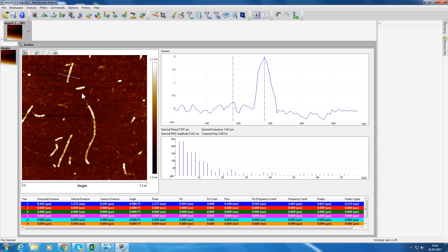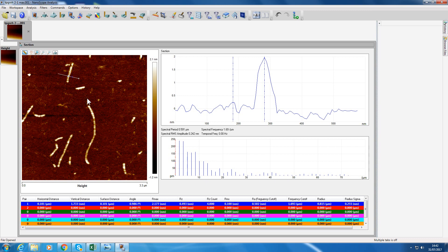It becomes a bit difficult when you've got this curve section here. The software unfortunately you can't measure contour lengths, but there is some software on ImageJ which can do that. I think that's just about it, so thanks for listening.